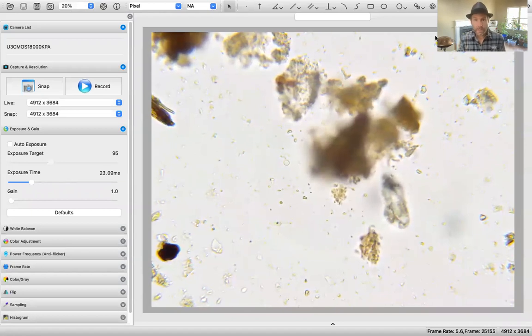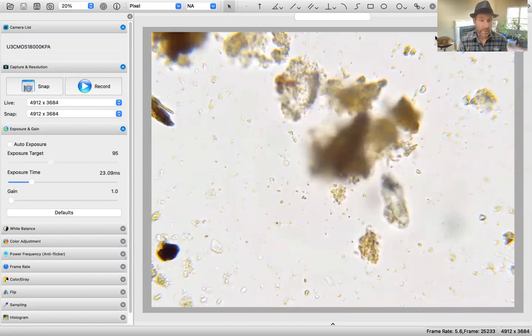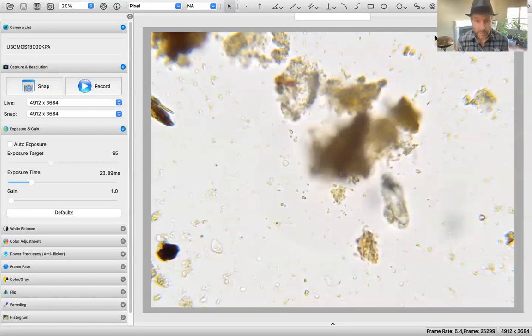I'm going to be doing my MPA3 today. I will be doing 5 readings, narrating only the first 5 fields of view with the swimming lane approach. My dilution today is a 1 to 5, and we're going to be looking at some compost. My screen is 200 by 300 micrometers, and I've got my 400x dialed in and shadowing, so we should be able to see everything pretty well.